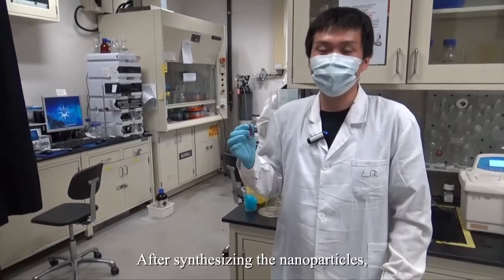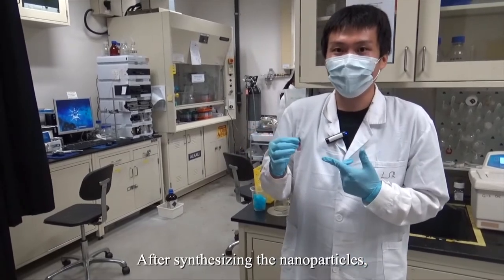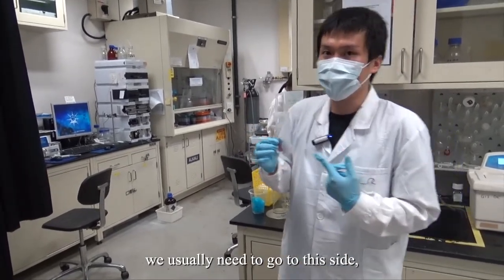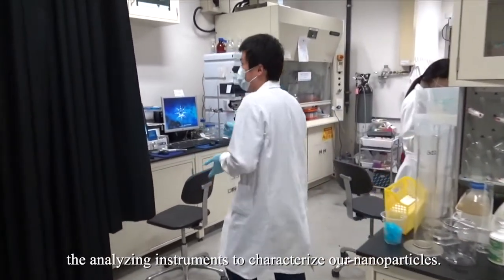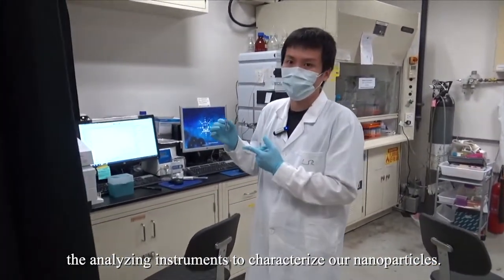After synthesizing our gold nanoparticles, we usually need to go to this side, analyzing instruments to characterize our nanoparticles.